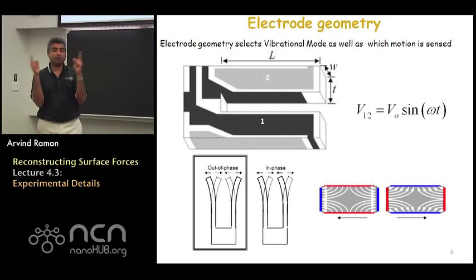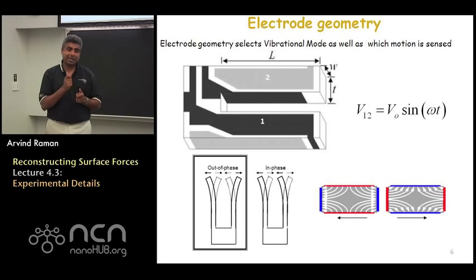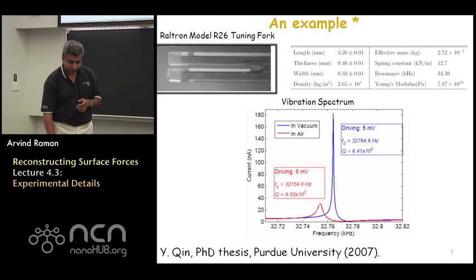There is another mode, which is the in-phase oscillation mode, which can be excited and is best excited by inertially exciting such a quartz tuning fork. So here's an example of what happens when you break one of these tuning forks out of the cylindrical capsule in which it's kept. This is an example from a thesis in the physics department at Purdue from Ron Reifenberger's group.